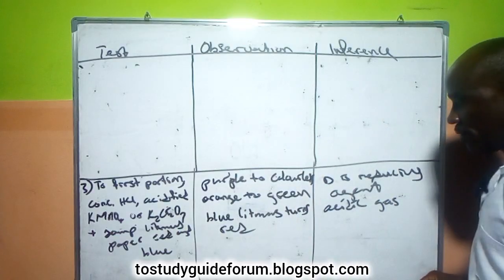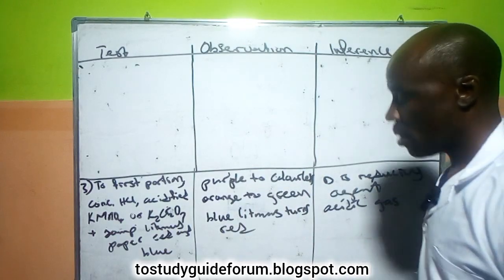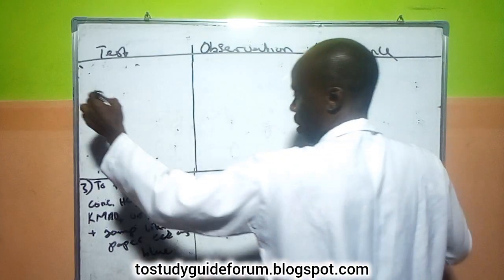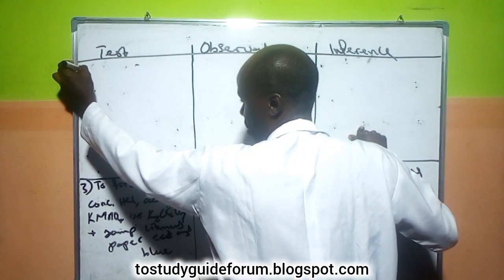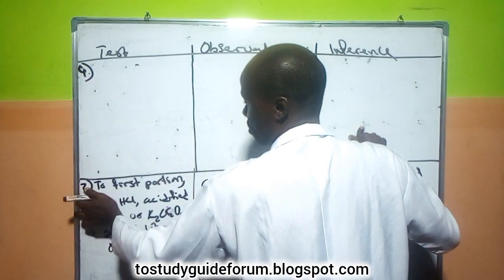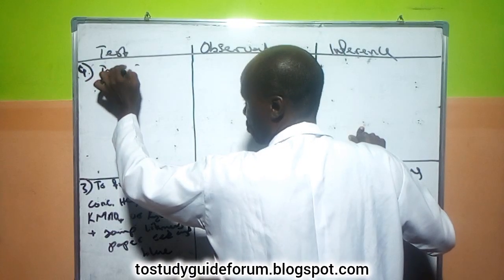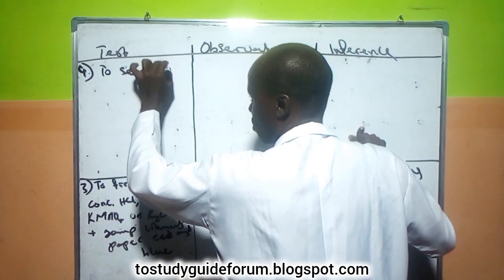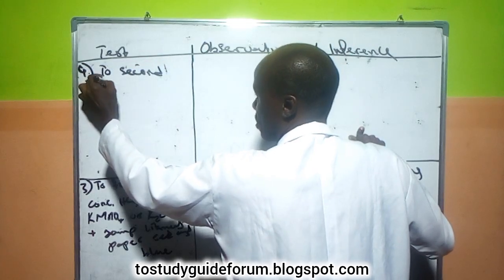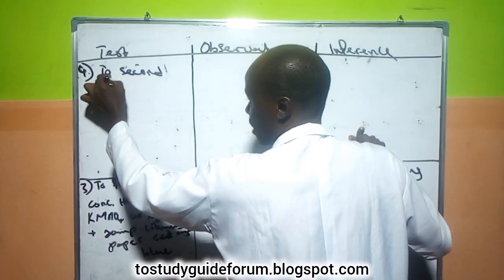So now coming over to this end, in the instruction manual or paper, we have barium chloride there. We did the first, the second, and this is the fourth one. So the second portion and the third portion, since I've already shown you what you are likely to expect, there's no need going over that again.